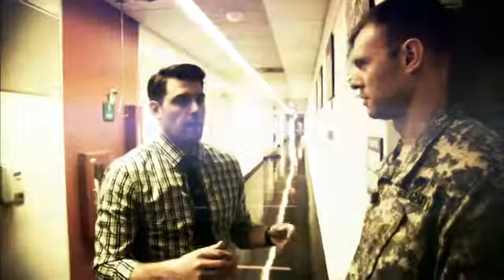Our first stop in the insectary was where they grow and harvest mosquitoes for their trials. I'm here with U.S. Army Major Silas Davidson, an entomologist. He's going to take me around the insectary, but first, why don't you explain to me what you guys do? We raise mosquitoes and we study malaria, and we also support vaccine development trials.